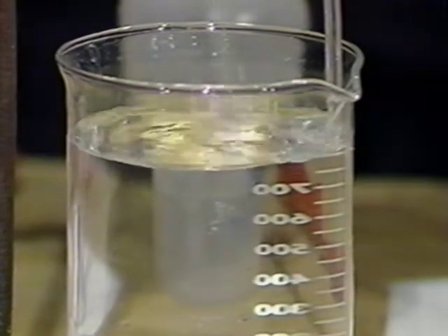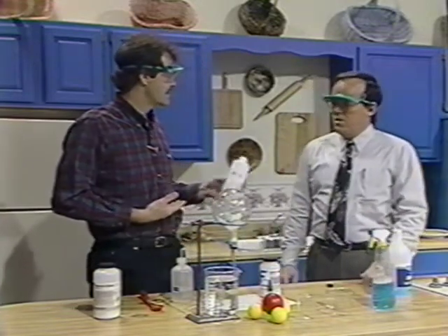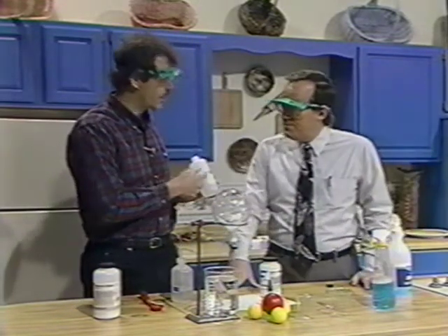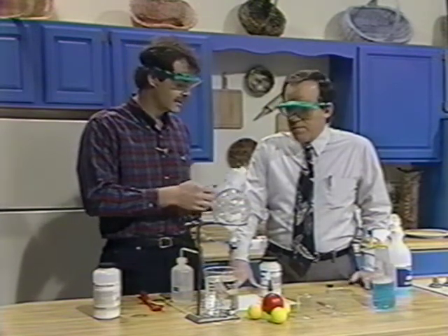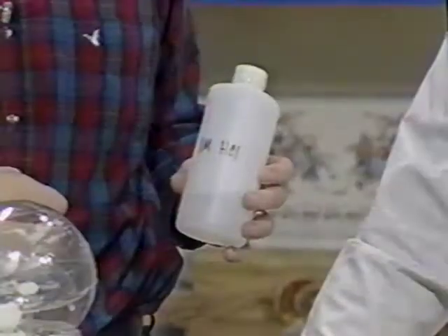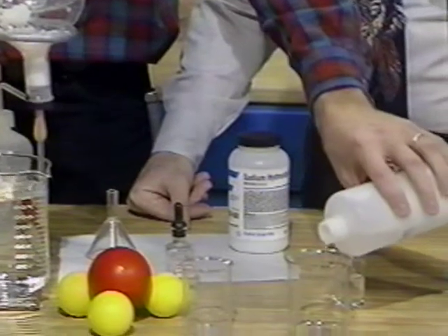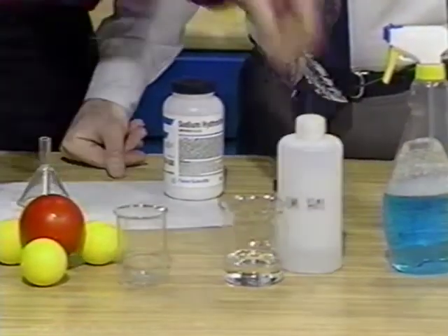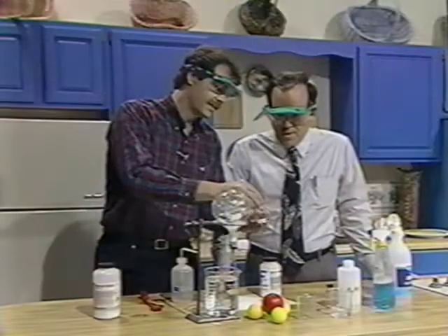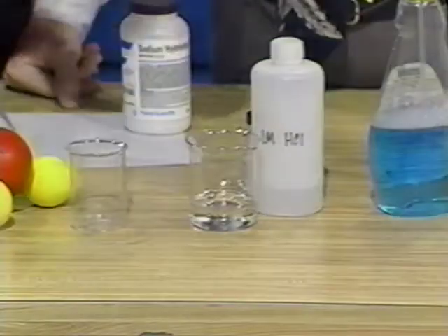This is a solution of hydrochloric acid — that's the acid that's in our stomachs. This is a one molar solution; that just tells us the concentration. That's about the same as our stomach acid, so from personal experience, that'll eat you. I'm going to pour a little bit into this beaker, and then I have some phenolphthalein, which is an acid-base indicator. We'll put a few drops of that into our acid and it stays colorless.